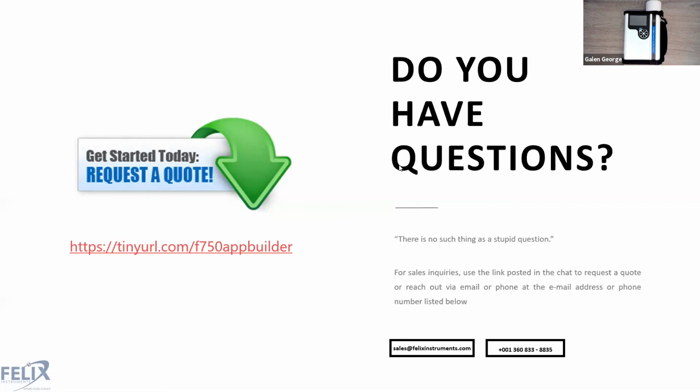The next question from Priscilla is, thanks for the presentation. How about very old NIR? Could I use data from a FOSS NIR system 6500? As I mentioned, this is something that is totally possible. If you have a CSV file that has spectra, you can still use that spectra. Spectral values are spectral values, so you can use the software to build that model.